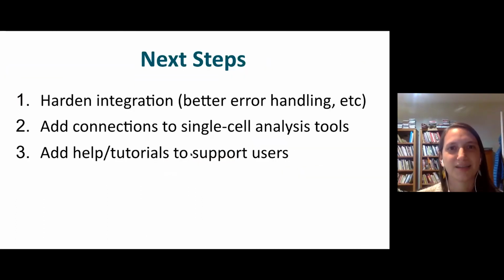So our next steps are to harden the integration. Right now, you really have to do everything in a particular order, and if you don't, then things don't work quite right. So we want to help people out a little bit better there. Also, adding connections to single cell analysis tools. This harkens back to the conversation right before I started about being able to translate between different formats, and then also adding some help and tutorials to support our users.